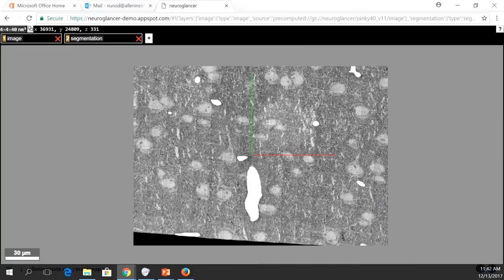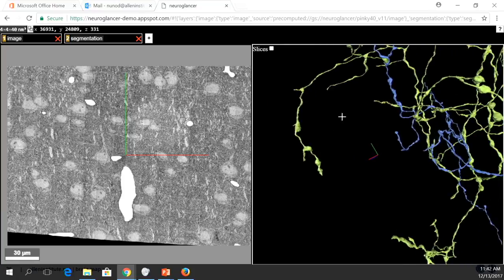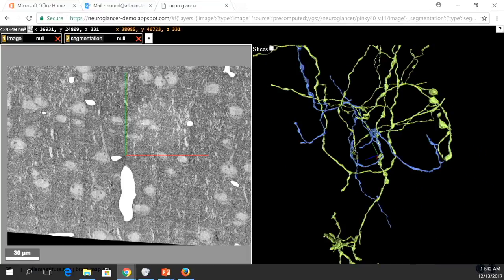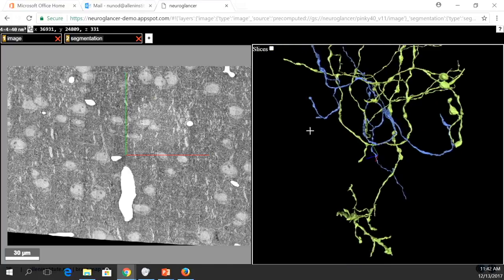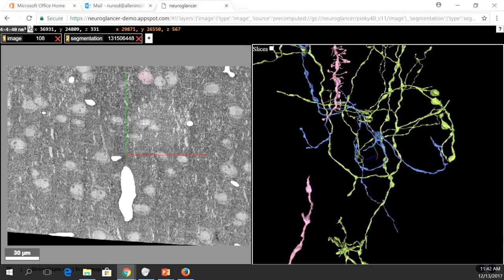The network is a bit slow. Okay, so here are two Chandelier cells. I know, because I've looked at this for a while, that one of the axons they are connecting to is this pyramidal neuron there from the border of layer 1 to 3 that should come out, which is now being generated.